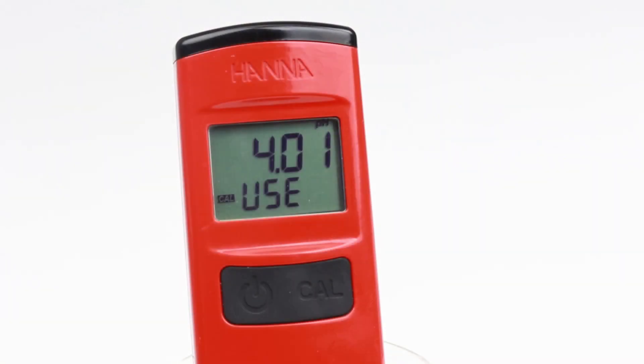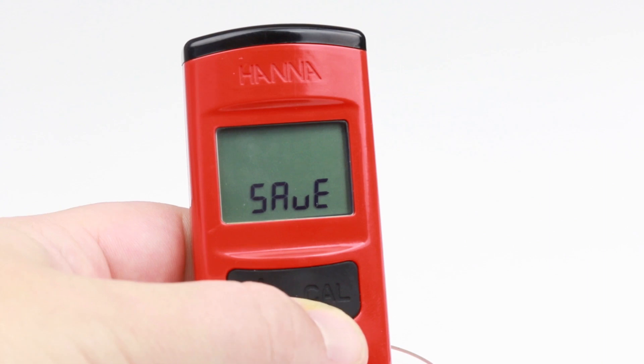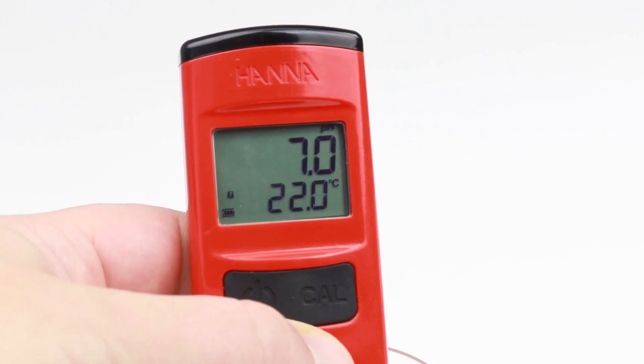For single-point calibration, press CAL key to exit. Save message is displayed and the meter returns to pH measurement mode.